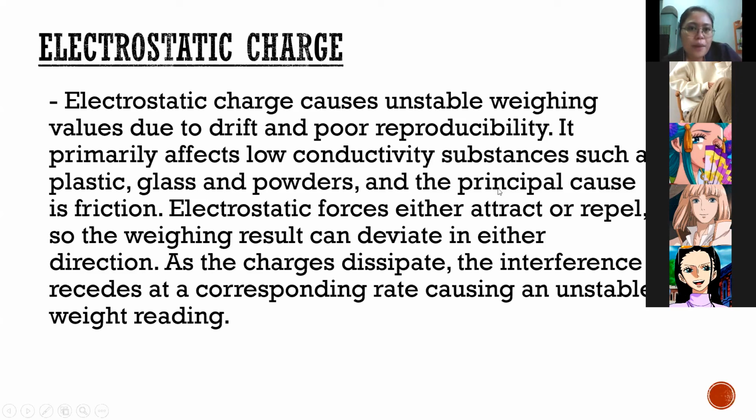Okay. So how about sa electrostatic charge? This also causes unstable weighing because of drift and poor reproducibility. Actually, this is due to friction. During friction, there will be electrostatic forces. Tungod na siya sa mga charges, positive or negative.